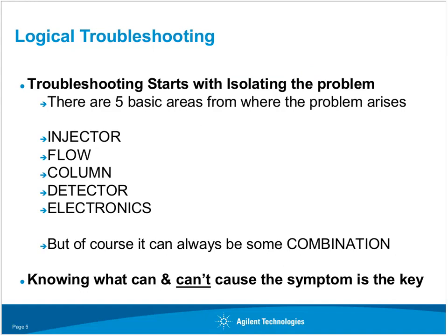What I will share with you, from the statistics that we keep, is that many of the problems customers struggle with come from the improper setup of the injection port. Now, in this troubleshooting seminar today, we will not go into the individual mechanics of the inlet. There are other e-seminars that I would like you to attend where we specifically focus on the inlet.